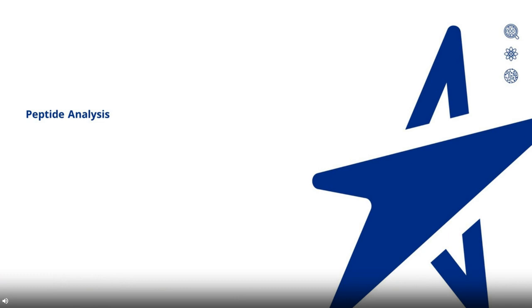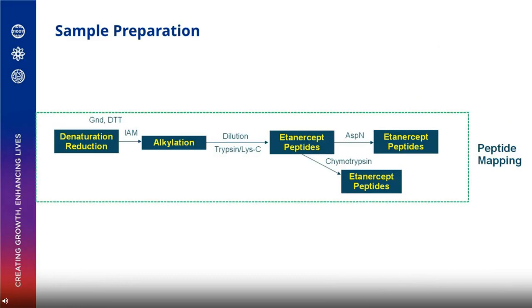Now we are working on using the bottom-up strategy to characterize with peptide mapping. For peptide mapping, we follow the standard: guanidine and DTT reduction for denaturation, followed by alkylation with iodoacetamide, and after that buffer exchange and dilution before enzyme digest. According to the sequence and enzyme specificity, we chose a sequential multiple enzyme digestion strategy to achieve the best sequence coverage and the proper peptide size to be analyzed.